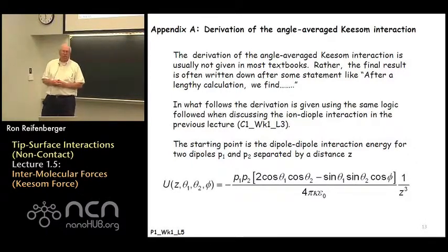So thanks for listening to this lecture. This was probably the most complicated lecture of the 5 so far. The next topic is going to be the London dispersion force. This is going to describe how two nonpolar molecules interact, one with respect to another. And once we finish the discussion of that, then we'll move on to tip-substrate interactions, which is what I'm sure most of you are most interested in.